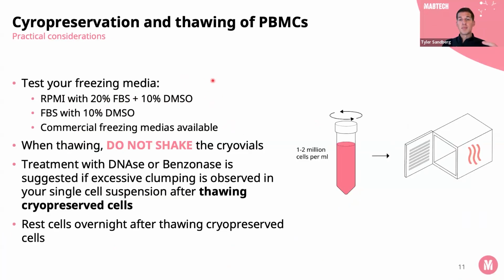Same sort of thing goes here. You want to make sure you're screening these methods and making sure you're not getting any of these that are creating unstimulated responses in your cells.